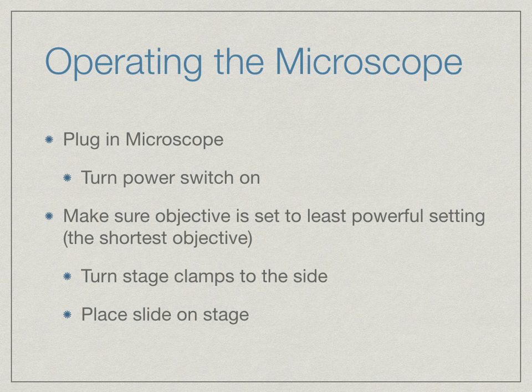To start operating the microscope, you will plug it in, then flip on the power switch, which is usually located on the base. Make sure the objective is set to the least powerful setting. If it is not, rotate the nose piece until it is on the shortest objective.